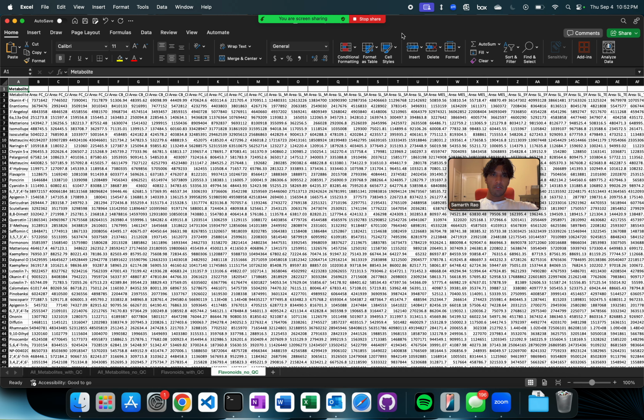I guess that's it for video 2. Your mentor should be able to guide you through this. I don't think this is super complicated. In the third video, I'm going to go over some of the code and the architecture and what's going on, in case you're interested, because someone's going to have to edit this at some point.